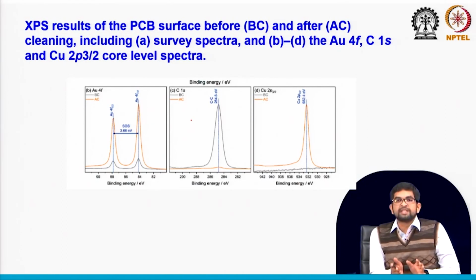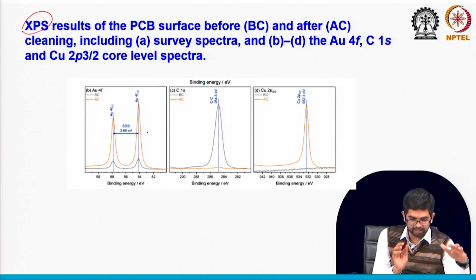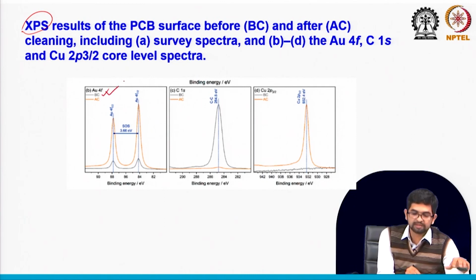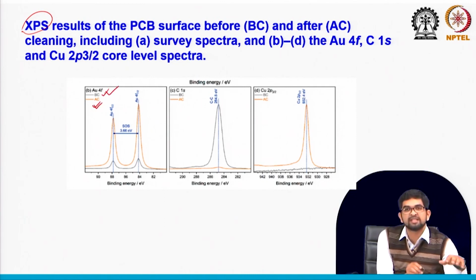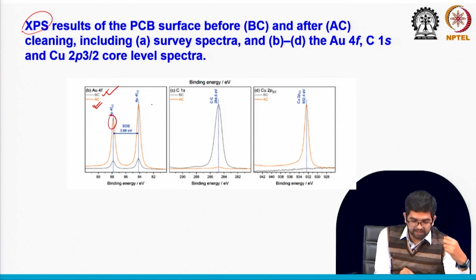Now, let us come to the XPS study, the X-ray photoelectron spectroscopy study. BC means before cleaning, AC means just after cleaning. This is the gold peak, right? The gold peak intensity was very low because it was covered by the contaminant. What contaminant? Organic contaminant. Then you can see the carbon peak here.